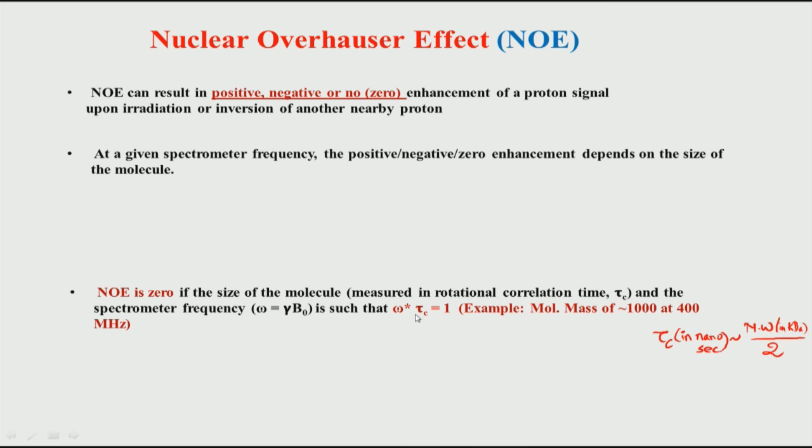So if you go to a lower molecular weight, in this case let us say you go to 5 degrees. Remember, the formula which I have shown here is typically for 20 to 25 degrees Celsius. But let us say I go to a very low temperature, 5 degrees; the molecule is still not static, the sample is not frozen, and let us say we are looking at a water sample.